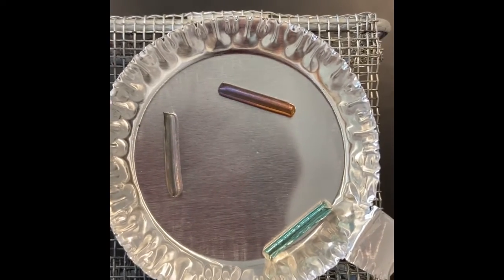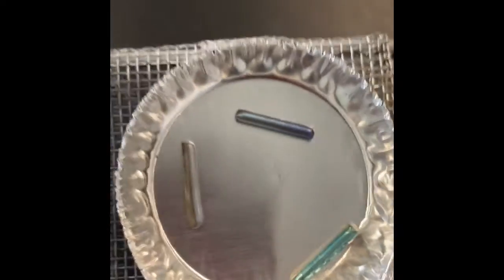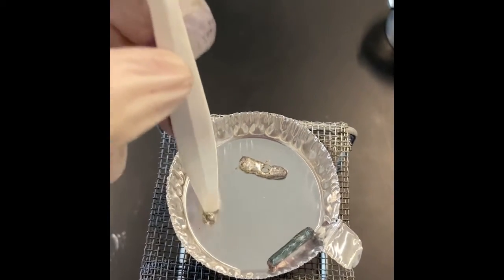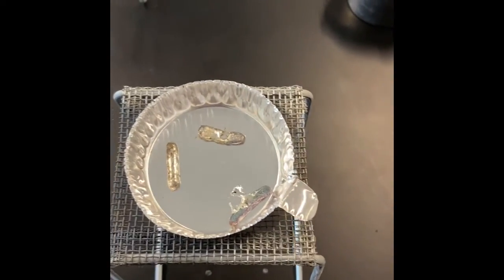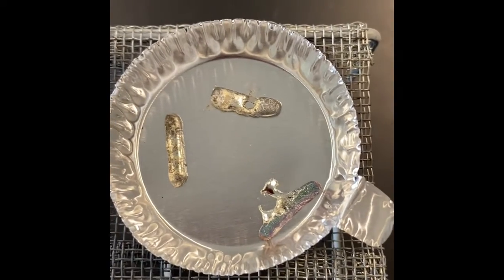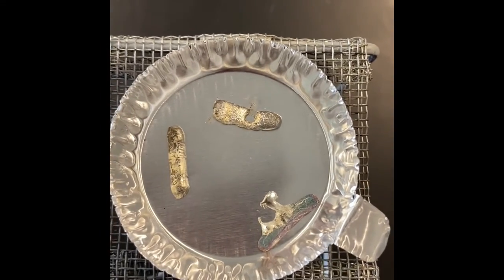Compared to the red one, which is changing all sorts of colors, and the blue one, which appears to maybe have melted, our green one looks fairly unchanged. And see, if I poke this, we have an entirely liquid metal here. Three entirely liquid metals. What's interesting to me is that the way all 3 of these became liquid, the time at which they melted, and the way they looked when they melted were all different because of the difference in the mixture that composed them.